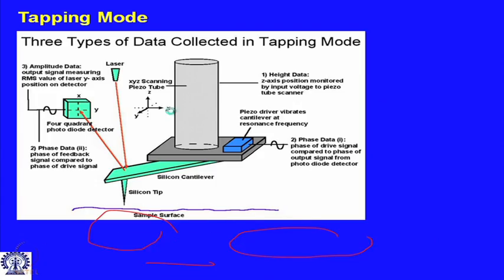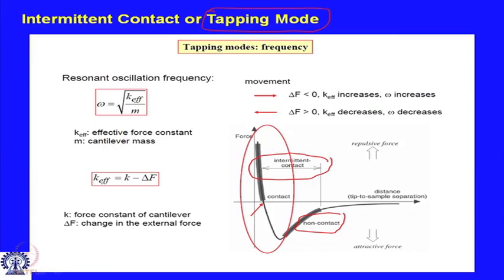You choose the amplitude by choosing the drive power, and you track this change in the amplitude as a function of proximity of your surface to the tip. But in contact mode there is no hardware to give any fluctuation to the cantilever. So, it is stationary, it is directly stationed on the surface, it operates in the purely repulsive regime, as you can see here.